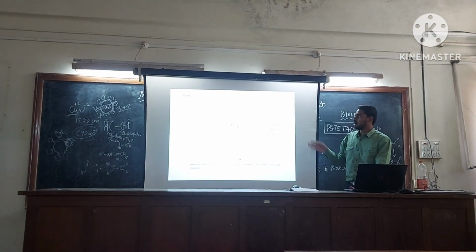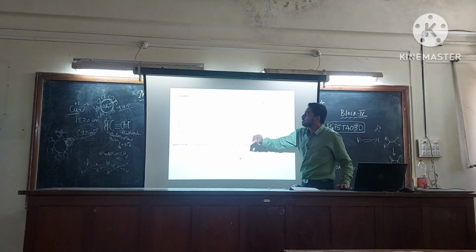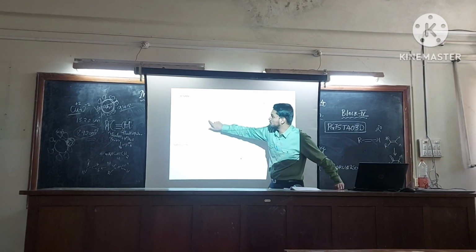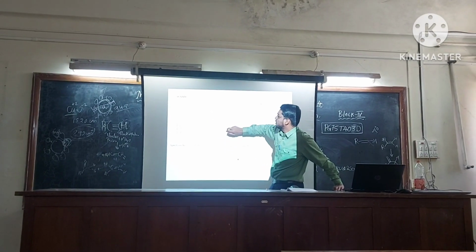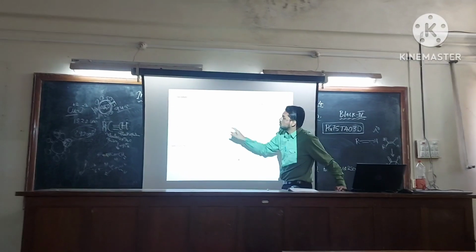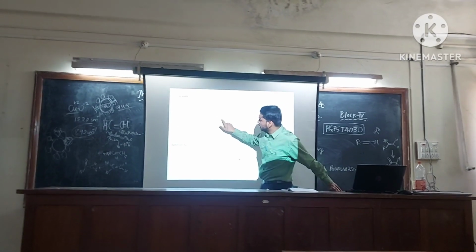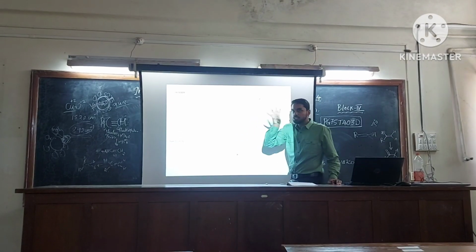So this is the spectra of the second compound. This is the proton NMR. As mentioned earlier, all things were the same, but this was the resulting 5.55 itself, and this also was 7.65. The variation was here because we have introduced a methyl group. Initially, these 5 plus 3, 8 protons were giving a multiplet. They were of the same genre.